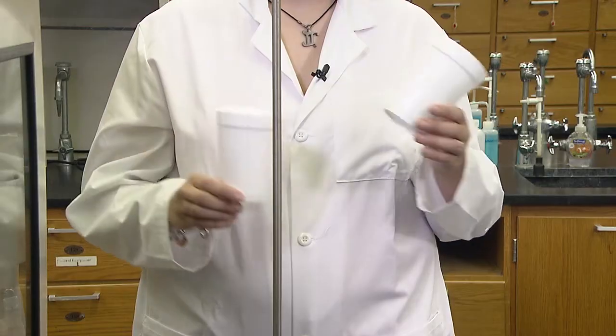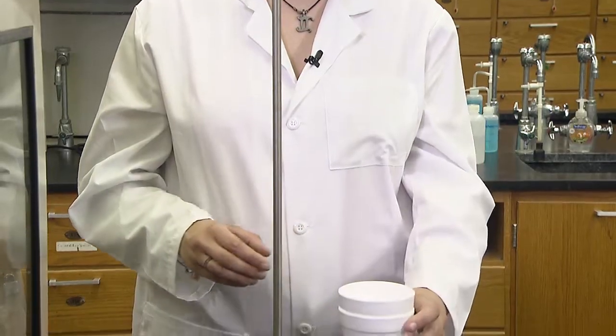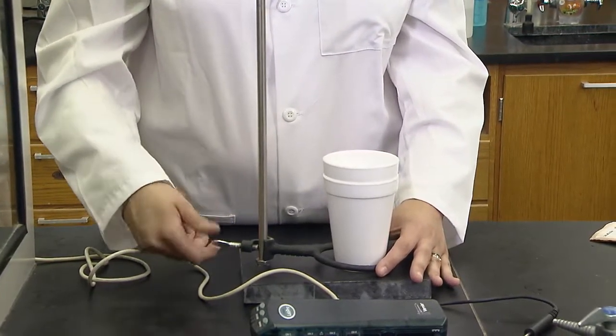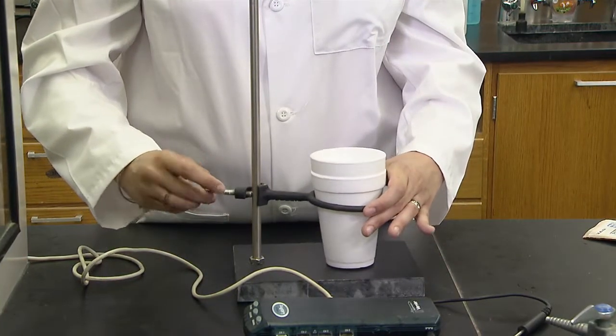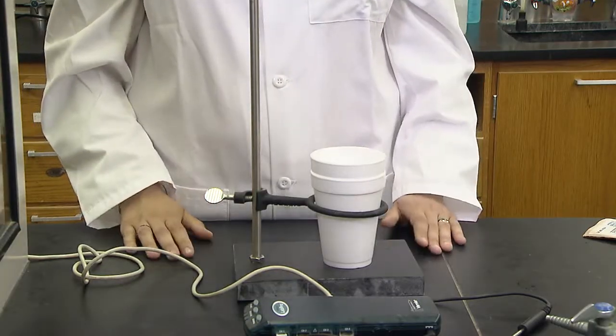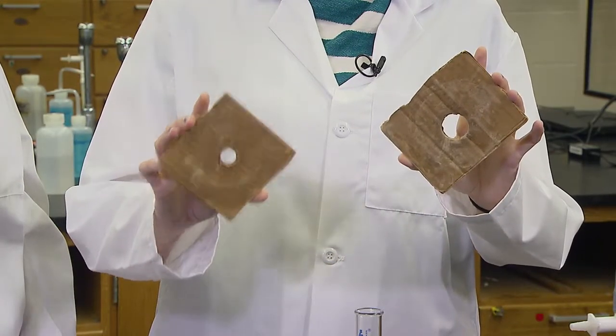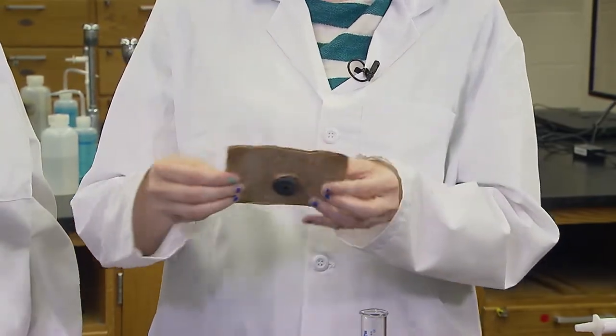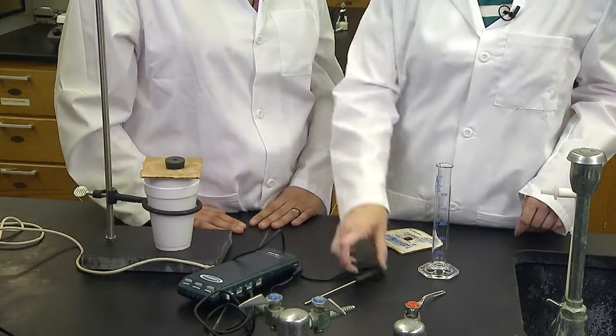Set the coffee cup calorimeter in the hood to help avoid spills onto the laptops. Use the same coffee cups throughout the lab to minimize air. The ring clamp helps to stabilize the cups. The cardboard helps hold in the heat. If the hole in the board is large, stoppers are available that the temperature probes fit through.